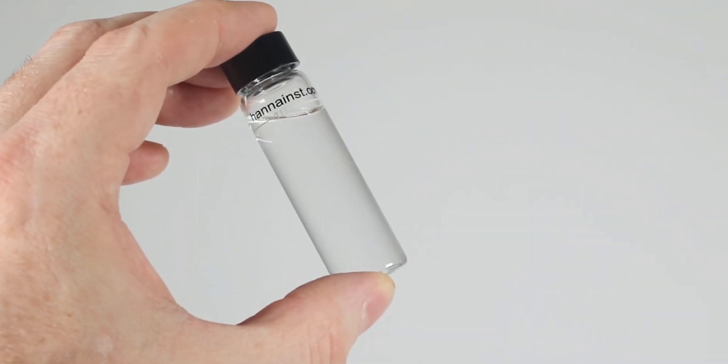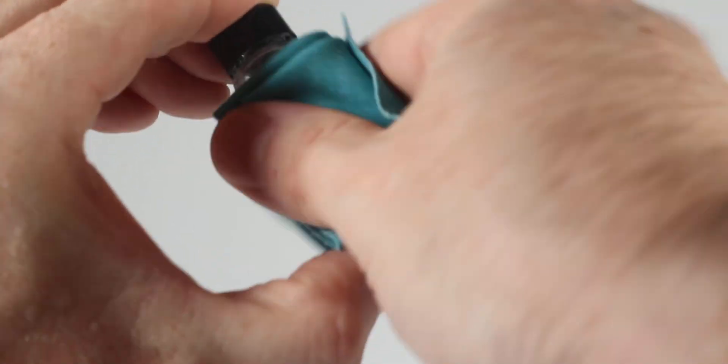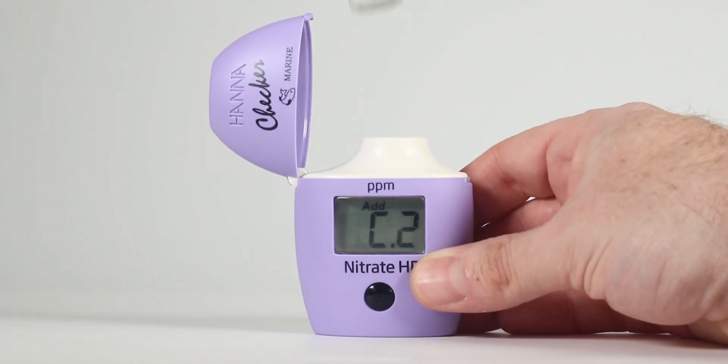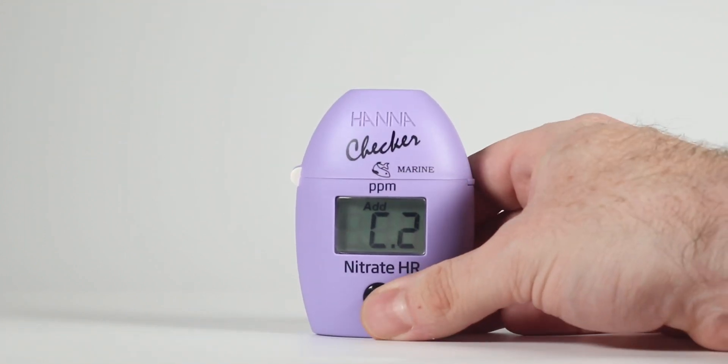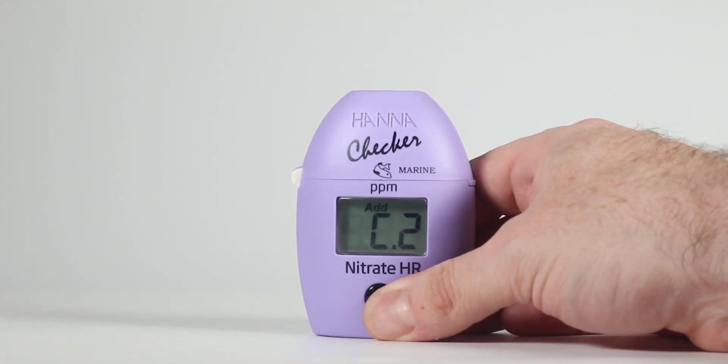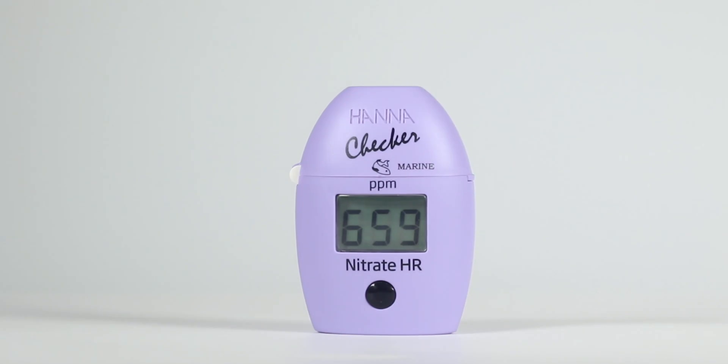Once again, wipe down the cuvette before inserting it into the checker. Insert the cuvette into the checker and close the top. Press and hold the on-off button. The display will show the countdown prior to the measurement. Alternatively, wait seven minutes and press the button.